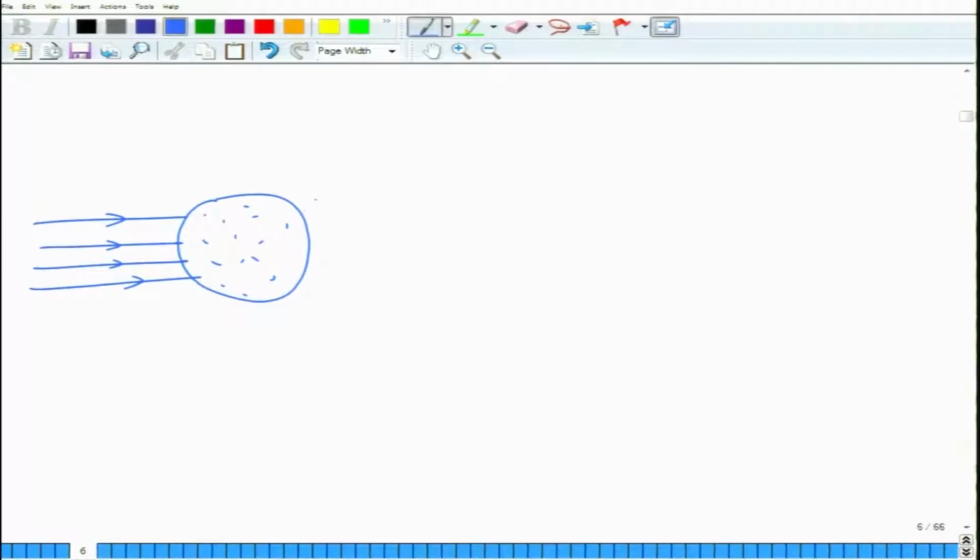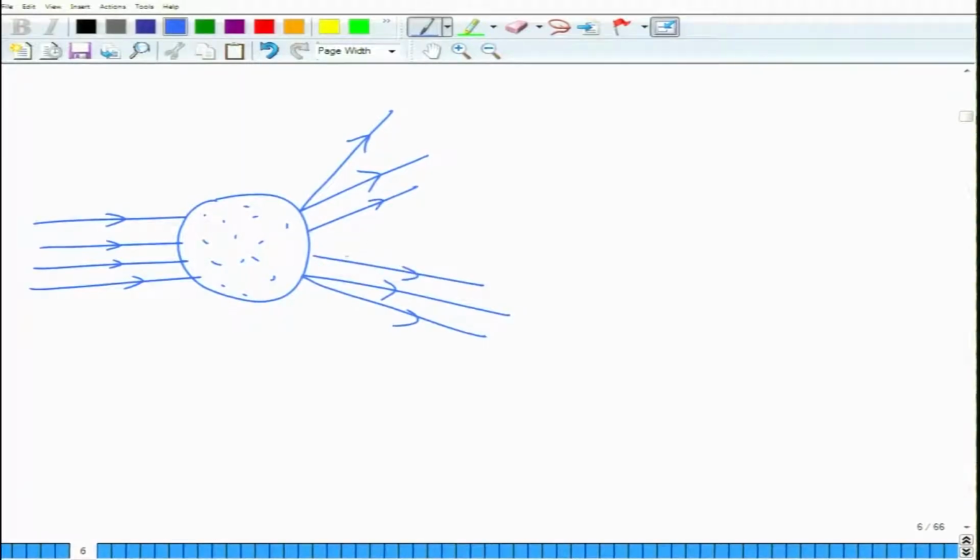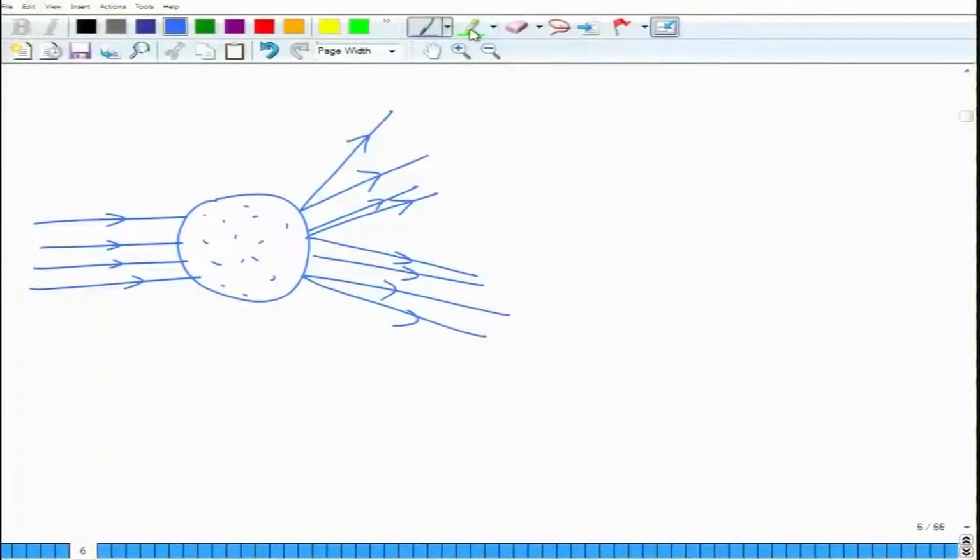So, this will be the transmitted beam. With respect to the transmitted beam, there will be some beams going at this 2 theta, and there will be beams going at all the different 2 thetas because it is a polycrystalline specimen. As a result, the X-ray diffraction pattern that you will get is something like that. So, this will give rise to a pattern which is achieved in this fashion.